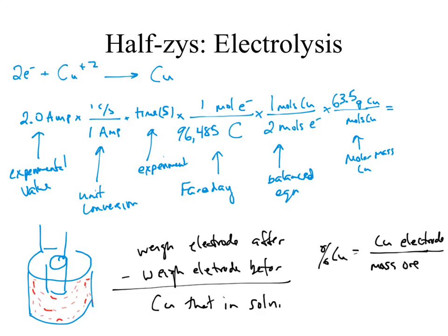Okay? You will not be using the entire ore sample, so you have to make sure that you get an accurate weight before you do all the dissolving process, because you're going to do it once for the electrogravimetric, and then you're going to do it again for the spectrophotometric. Questions about that? Is it 3 to 4 grams each time? Whatever it says. Does it tell you to calculate it, or does it just tell you the number? No, it just says 3 to 4 grams. Okay, good.